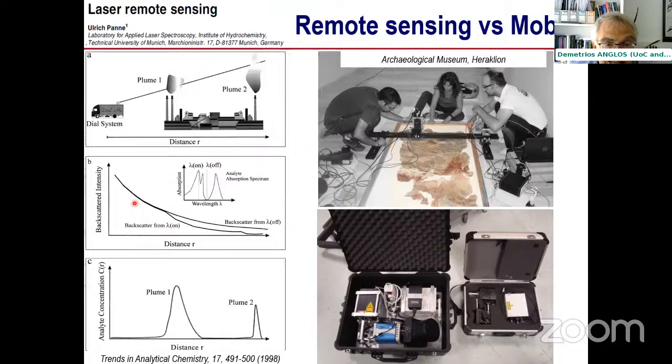But sometimes we see further reduction of the backscatter light because at some point along the path there is some substance, some smoke, some whatever that is partially absorbing and therefore reducing the intensity of the beam, both ways.